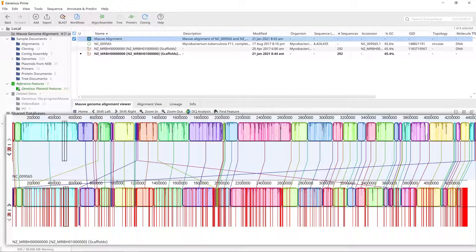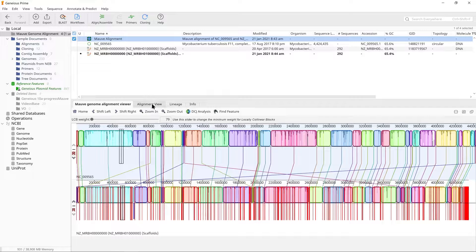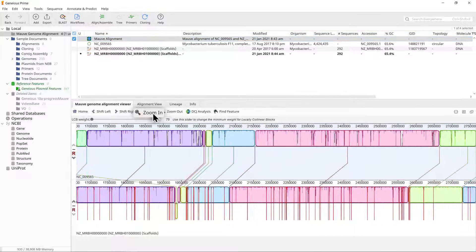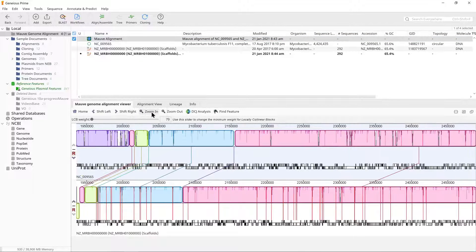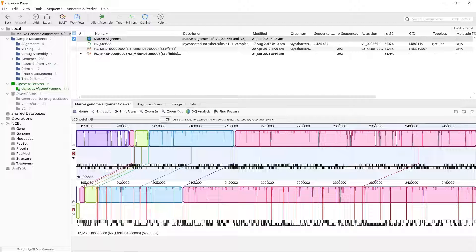The red vertical bars on the sequence denote the boundaries of the individual contigs in this genome. Use the zoom controls above the viewer to inspect some of the LCBs more closely.